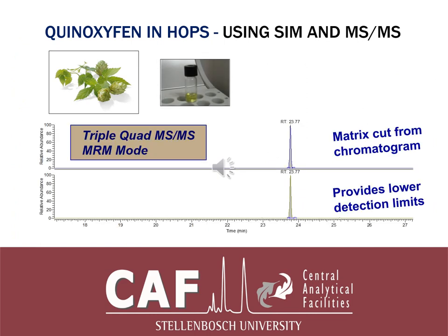Now look at the spectra of this chromatogram here that we've got of the same compound using the SIM and the SRM or MRM.